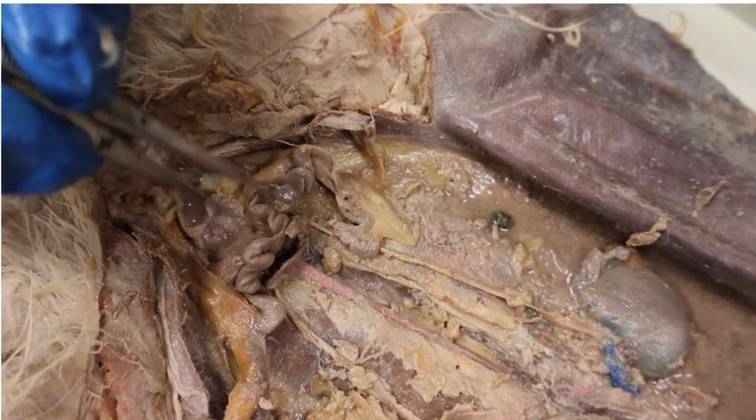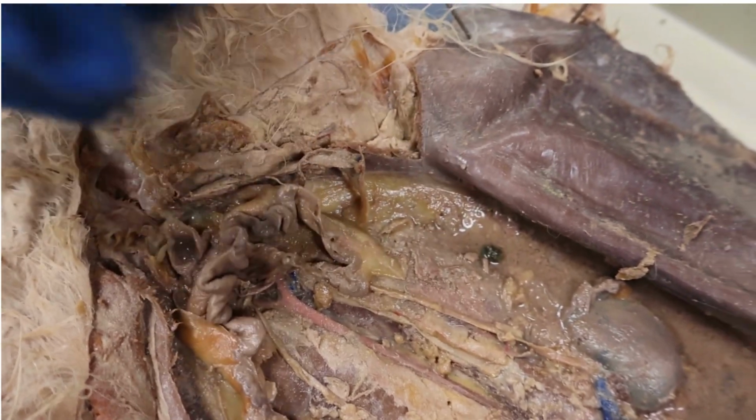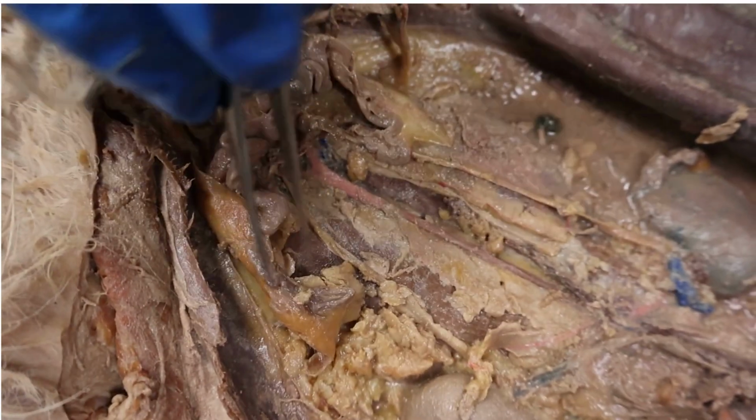Can we get one show of the uterus real quick? So this is going to be the uterus. The fallopian tubes are on the sides, and then just one more good look at the ovary. I don't know how big it is.